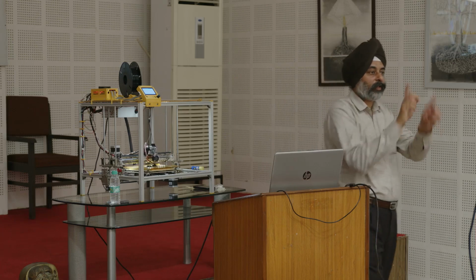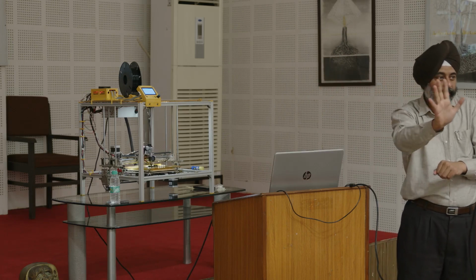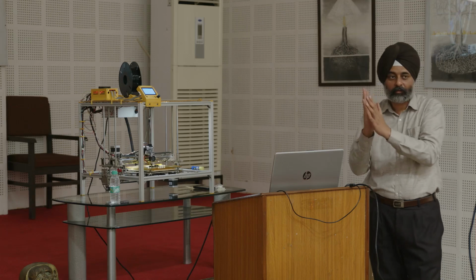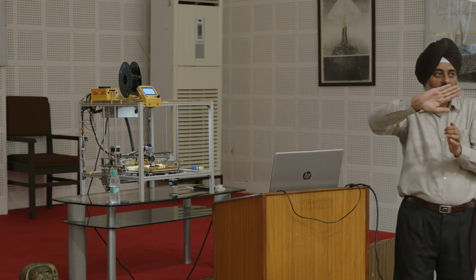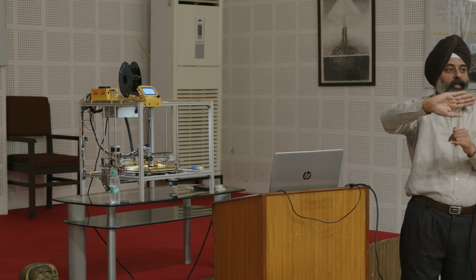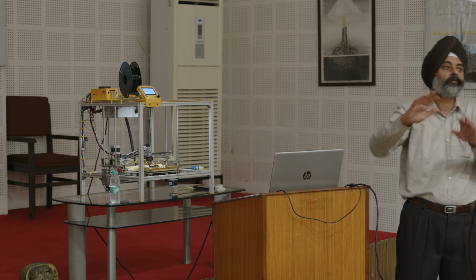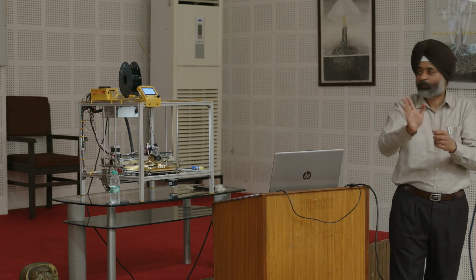So if you energize 2 coils instead of one, the rotor will come and stop in between, so it will stop in between, and that way you can have half step. And if you continuously alter the magnetic field strength, the rotor will move slowly. Maybe instead of 2 you can have 4, 8, 16, 32, or maybe 64 or 128 or 256 microsteps in between. So that gives you very smooth and precise rotation.